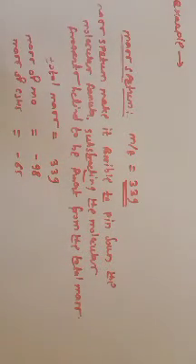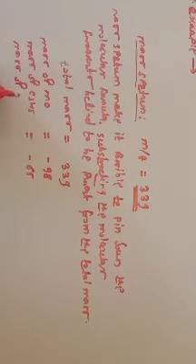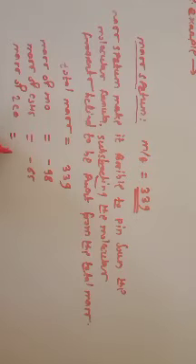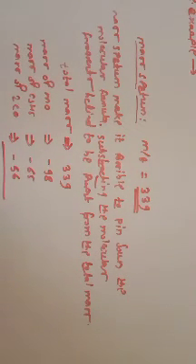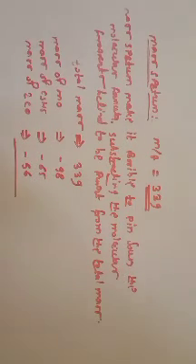Again, the next one is the mass of two carbonyls, which is equal to 56, so I have to subtract that. So the mass of molybdenum, the mass of C5H5, and the mass of two carbonyls are subtracted from the total mass, and finally after subtracting we get the remaining mass, that is 120. So this is your remaining mass.